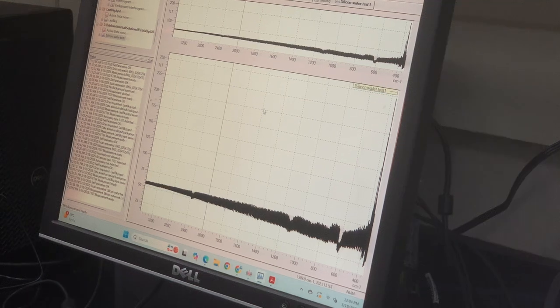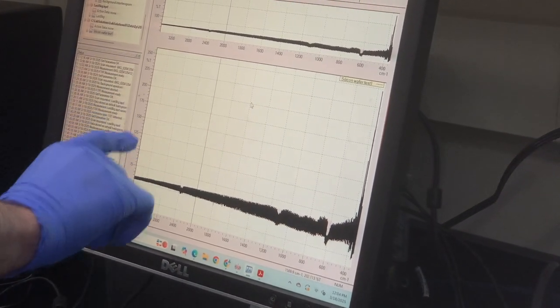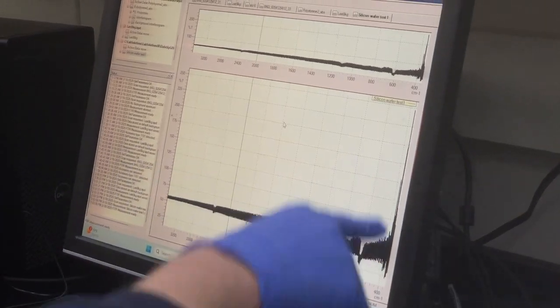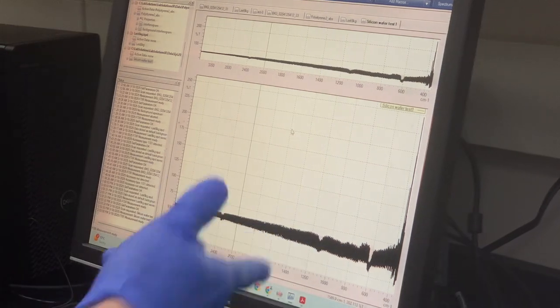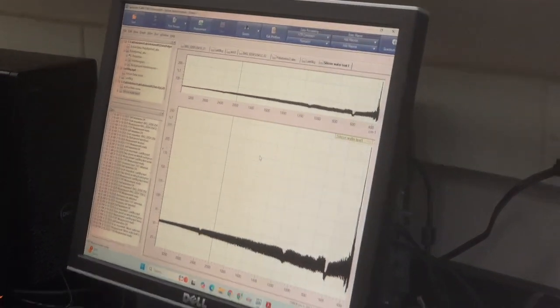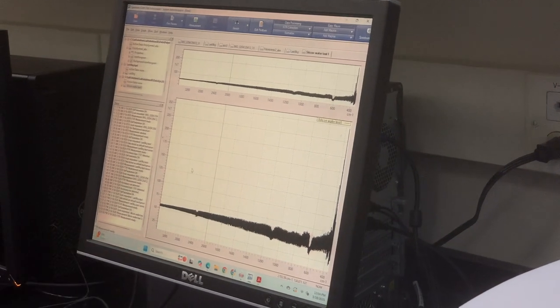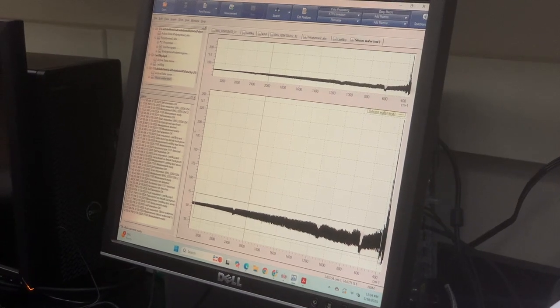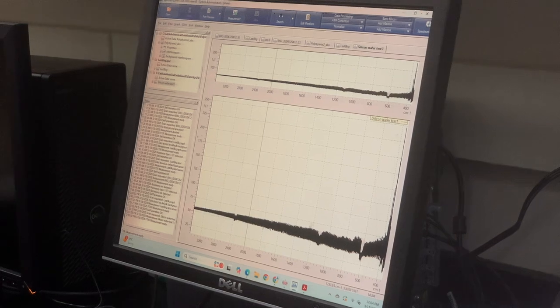Okay, then. I have different questions going. So first of all, why does it go to 250%? It should be maximum 100, right? Something here is going to very high transmittance. I'm not sure what that is. Might be an error. I don't know. This looks very strange. Like a typical IR doesn't have this. Maybe these are noise?